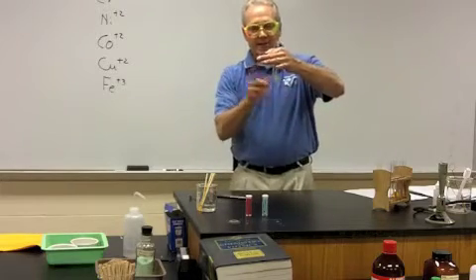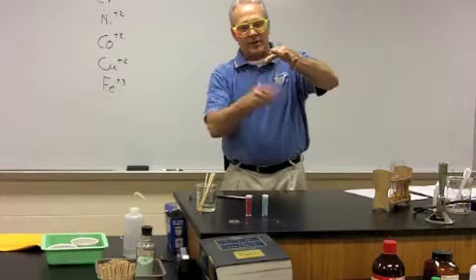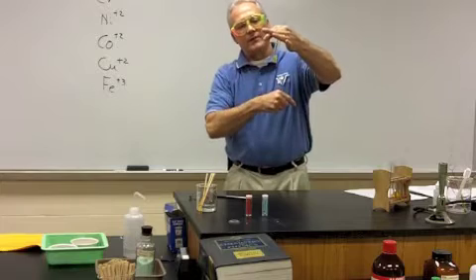And we'll go ahead and mix this up. And this is how you do that. Just hold that between your forefinger and your thumb, squeeze on it, and then just start hitting it like this, hitting it back and forth like that. And that creates a little whirlwind in there to get it to dissolve fairly quickly.